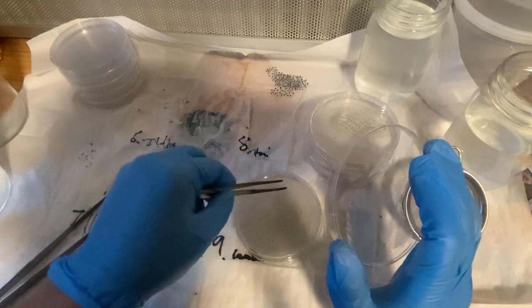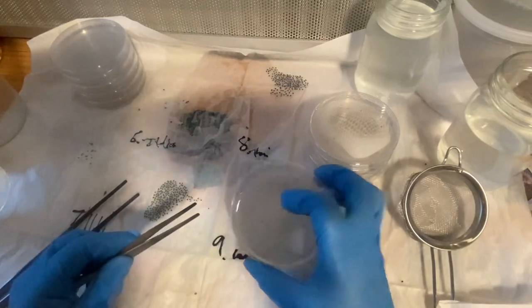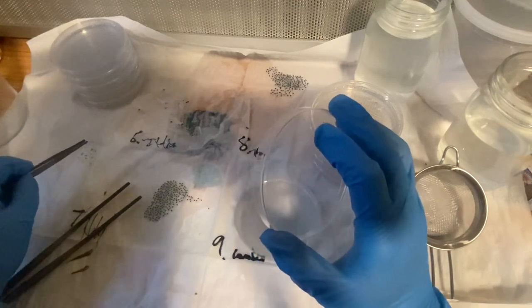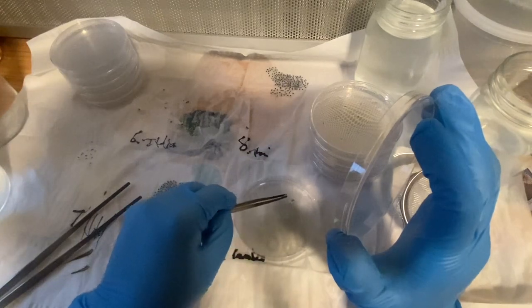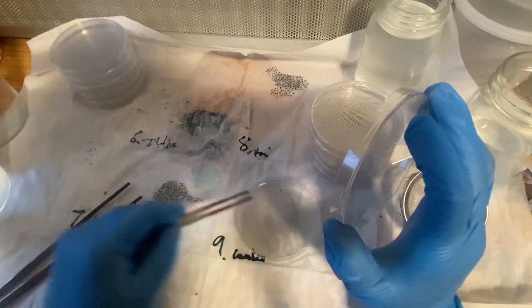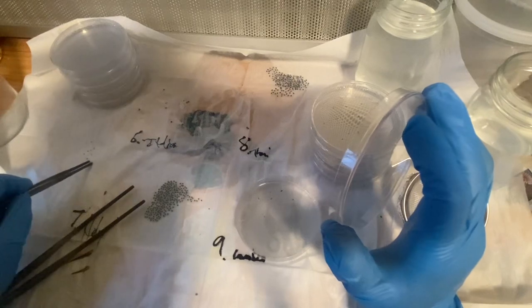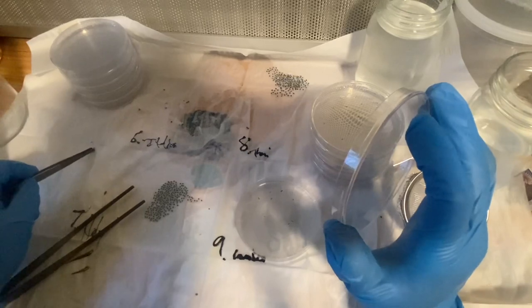You always want the seeds to be kind of half in the media, half out of the media if they're big enough. If they're really tiny, just spread them across, but you don't want to bury them, or the lack of oxygen will prevent them from growing sometimes, and it'll actually kill them. So it's best to just leave them on the top if you're not sure. And if so, you can just put them half in, half out.